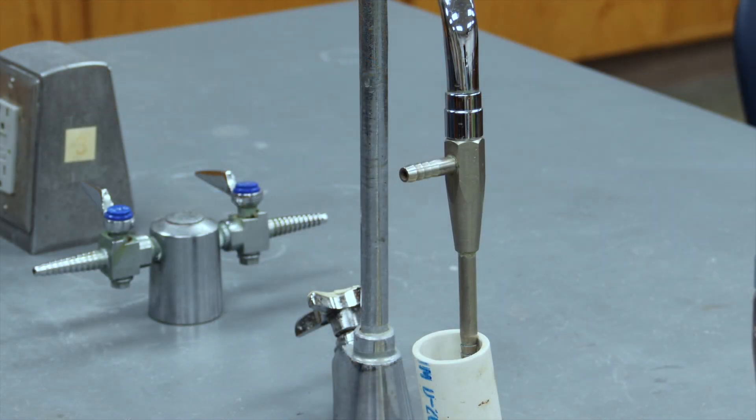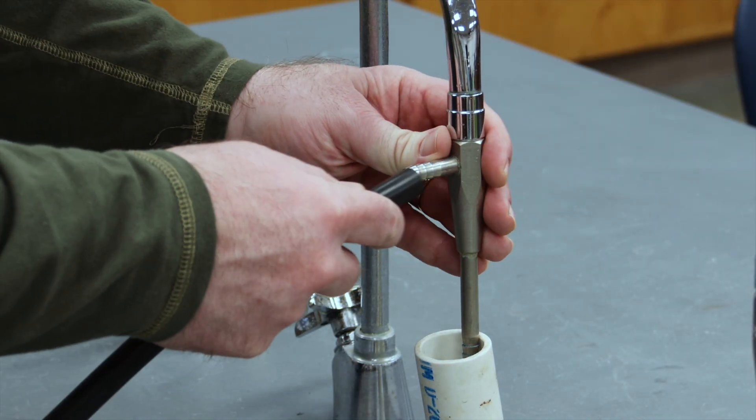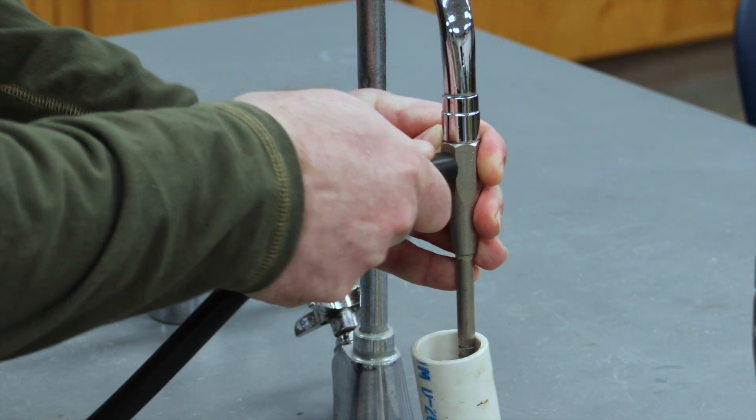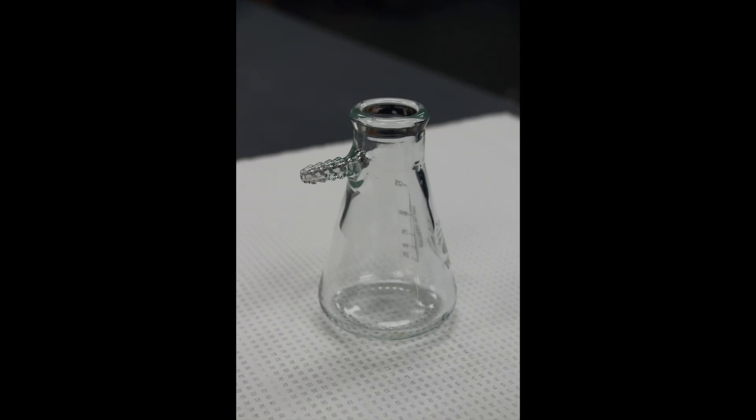You'll want to attach a thick-walled rubber tube to this vacuum inlet. You'll then attach the end of that hose to the glass barb on the vacuum flask. The vacuum flask is a special type of conical flask with thick walls that allow the flask to withstand the vacuum.